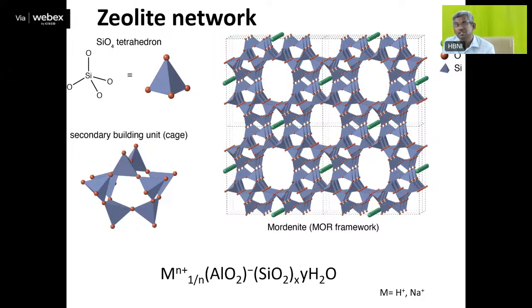I have mentioned in the last class also, because there is an ordering, a regularity, a periodic arrangement. Here also there is a periodic arrangement. All these bond angles are the same, and the bond lengths are also the same; this bond is the same as this bond. All 4 bond lengths are the same. So you will get a very sharp line.